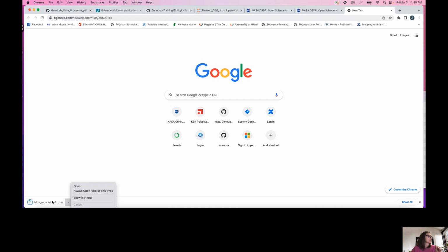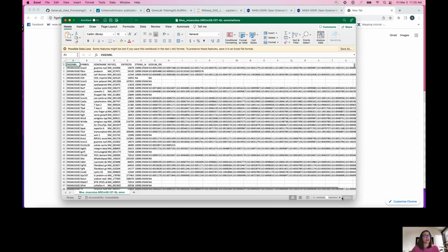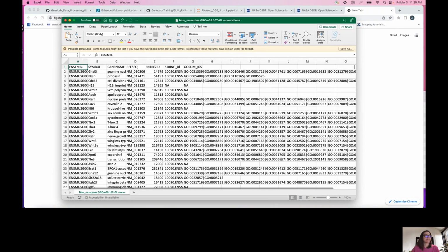So does that mean the file is being uploaded already, or we still need to use the table to upload the file? We are going to be pulling in the table, right? Because it depends on what organism you want to use. I don't know yet which file you're going to want to use. This is the mouse one, it looks like.